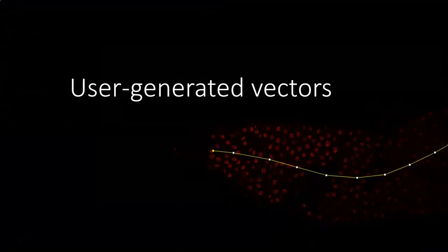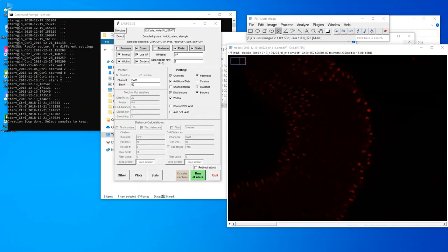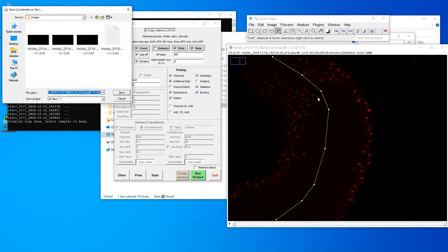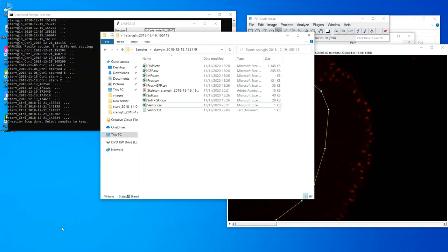The vector files can alternatively be fully self-created and given as input to guarantee best linearization of the sample data. An easy way to create vectors is by drawing the vector on top of the microscopy image with Line tool in ImageJ and then exporting the line's coordinates. The self-created vector files must be placed in the sample folders just as automatically created vectors.